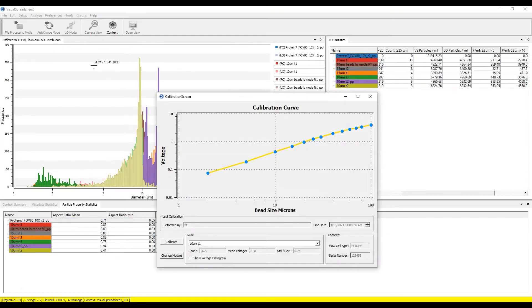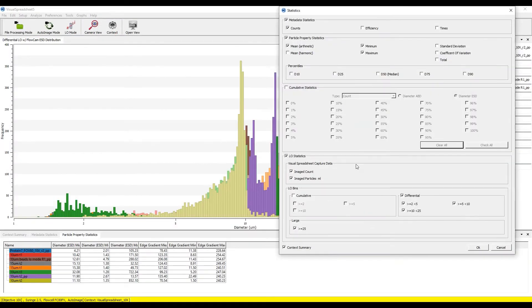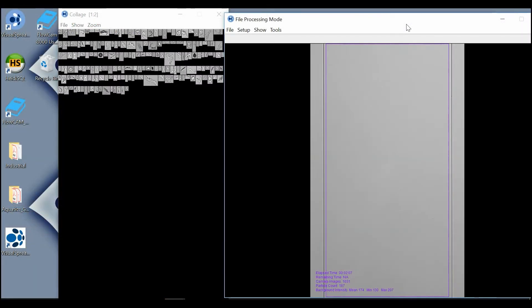With the FlowCam LO, you get the current industry standard in particle analysis combined with FlowCam's state-of-the-art flow imaging technology.